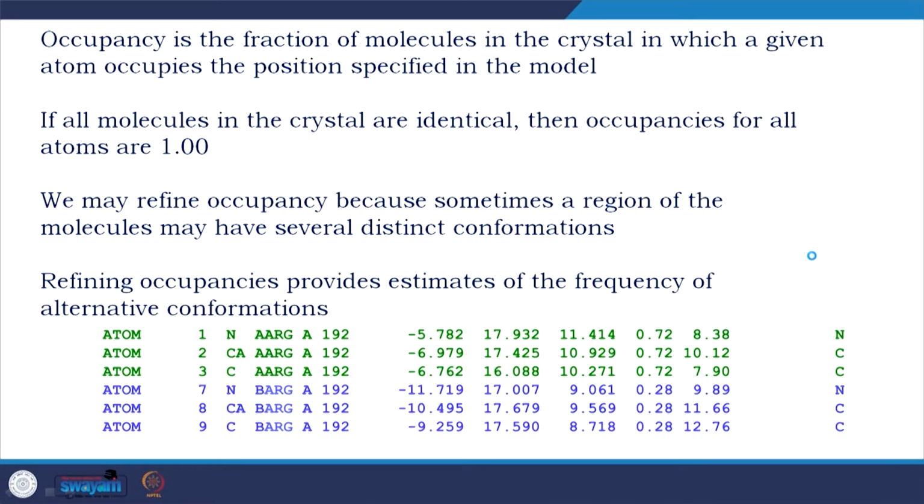I have to talk about that because that is one of the most critical parts of structural biology, because whatever we are doing, the output would come in the .pdb format, which is a format where you get the x, y, z coordinates. Here I am not going into details because I am spending a few classes on this, but you will see that the x, y, z's are there, right, and this is the occupancy.